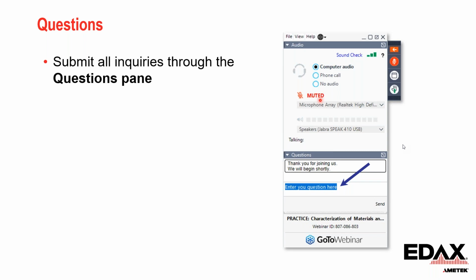And for the WDS, we do not have the diffractor to cover this range. Actually, the best practice to detect lithium is using our Cipher system, and you can get some information on the Cipher system on our website. Basically, Cipher is the first and only system that quantitatively reveals the distribution of lithium in the SEM.